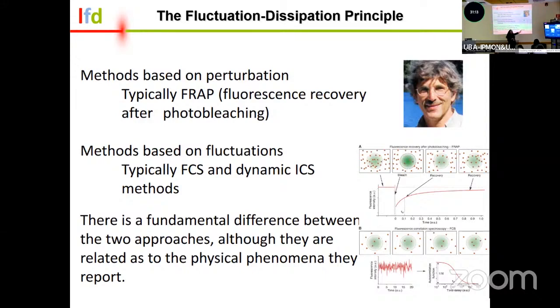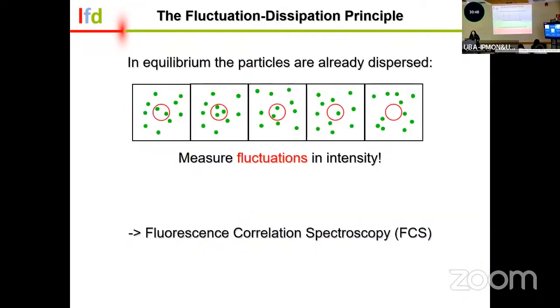And now you can use a mathematical calculation. We say, okay, is this fluctuation from the same molecule? And the property of FCS is that you have to be at low concentration and that molecule has to be the same for it to correlate as a function of time. So we see this decay, okay? And I'm going to talk a little bit more about this.